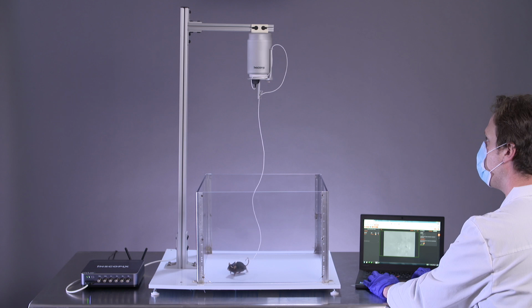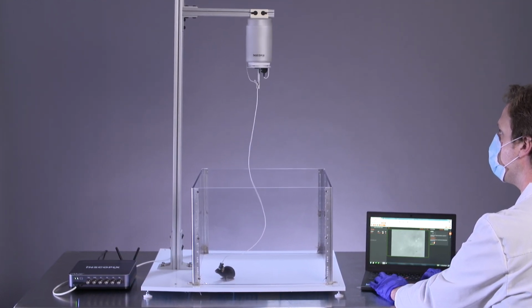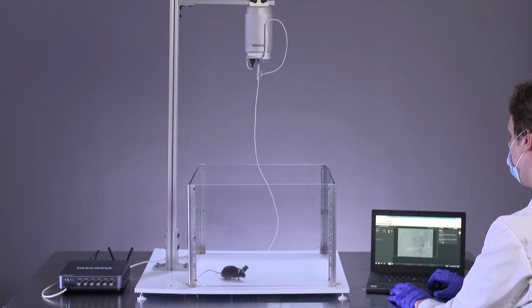However, we were able to, with a very small number of optical elements, develop a system which is completely achromatic on its own, and we've paired it with endoscopes. So I'm proud to say that through the combination of hardware and software control, we're able to develop an impeccable solution to two-color imaging. I think the miniscope technology imposes itself as a must in systems and circuit neuroscience.